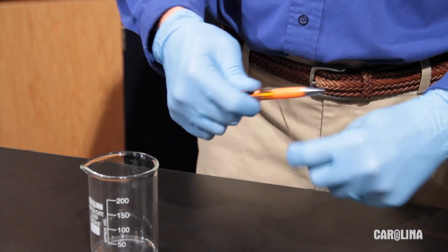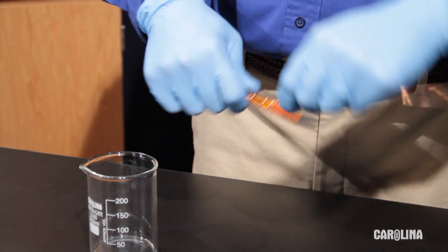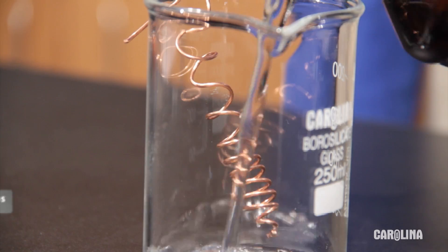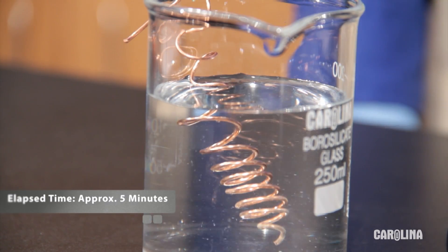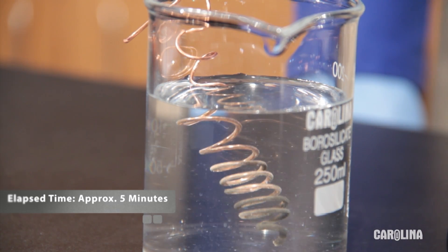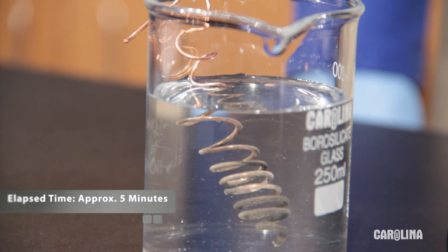To get started, wrap one end of the copper wire around the pen and let the rest of the wire hang from the side of the beaker. Pour silver nitrate solution into the beaker. Immediately, you'll see silver particles form on the wire, and you'll also see the solution turn blue.